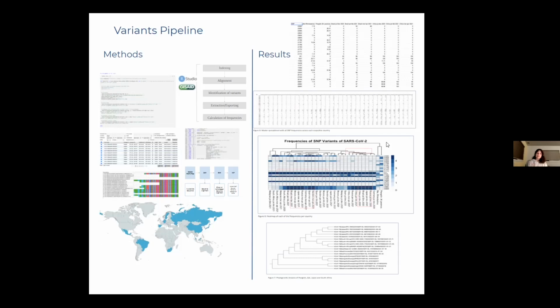As the values progress to March to April 2021, the frequencies 23063 and 23603, which are a part of the mutations N501Y and P681H respectively, significantly increase over 6 times its original value. The mutations are responsible for greater resistance to antibodies, which would allow it to evade the immune system. SNPs 241, 3037, 14408, and 23403 stayed relatively the same, as they play a large role in increased transmissibility of the virus when combined together.